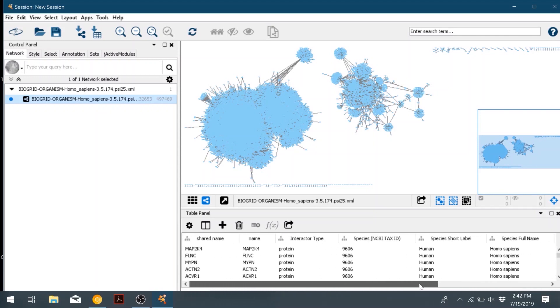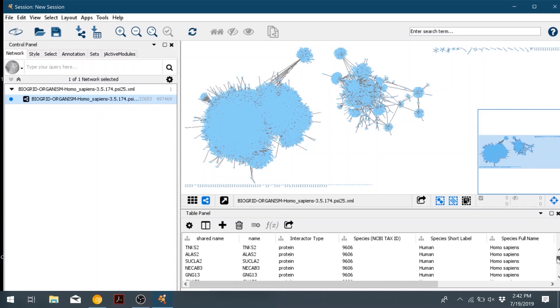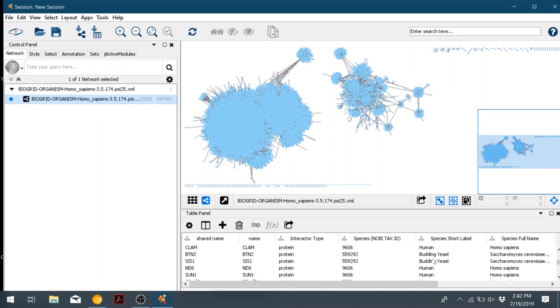If we look under the species column, we see that there are other organisms besides human. For our purposes, we would like to have just the nodes and interactions that are between human and HPV.